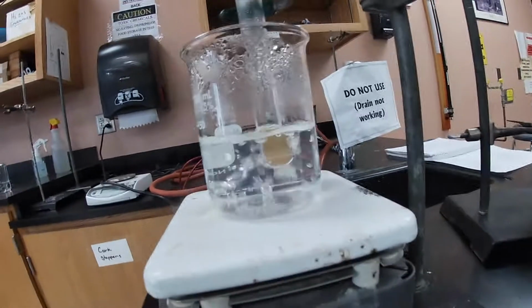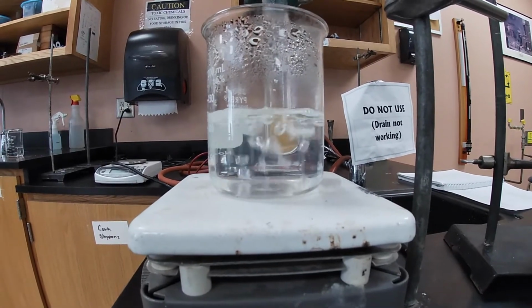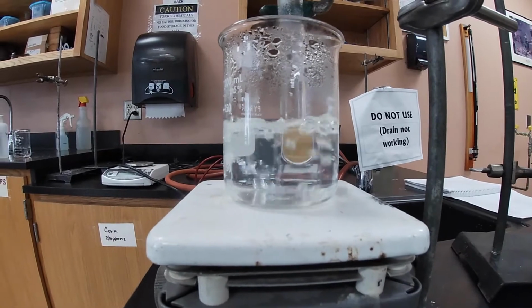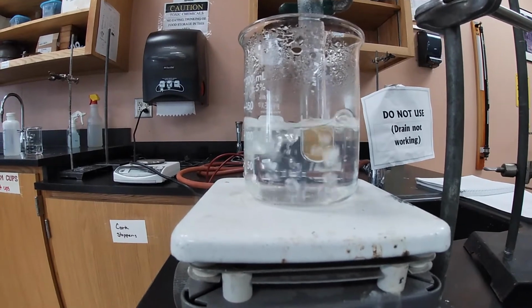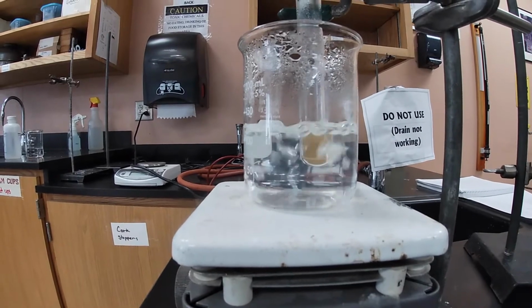After the 5 minutes, if you notice our test tube, there was some glucose present, so some of that glucose did go through our filter paper. That means the remaining solutes inside that filtrate were glucose and of course the chloride ion.